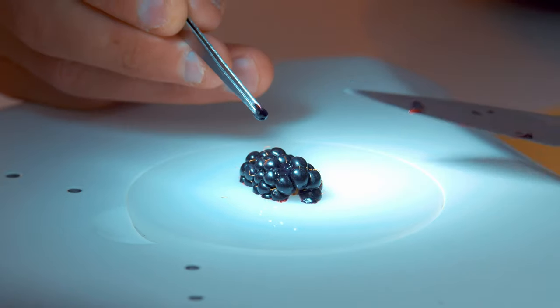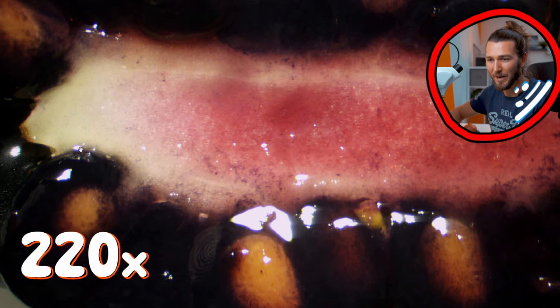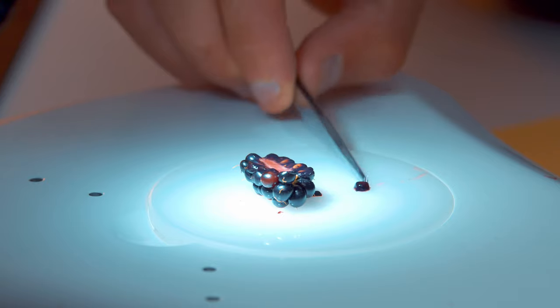I broke it open — there we go, detached. Now all the liquid is gone and you can't see much under the microscope here. I would have to use some other external light. The liquid here is much more see-through than on the raspberry. You can see how this blackberry is attached to the stem inside, pulling all the nutrients out.